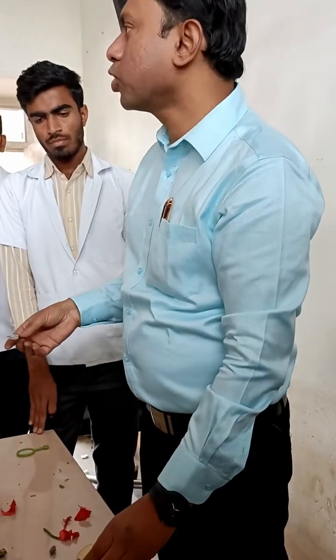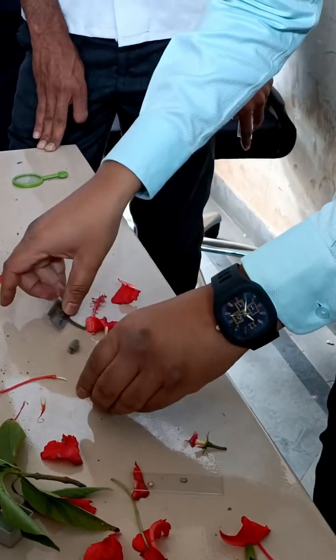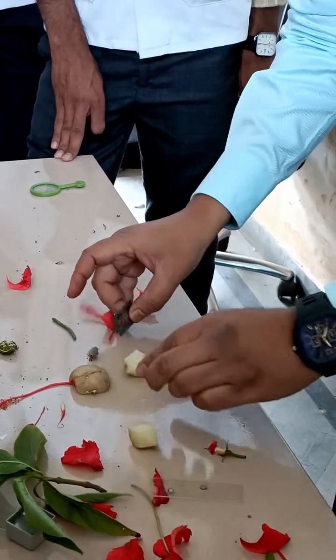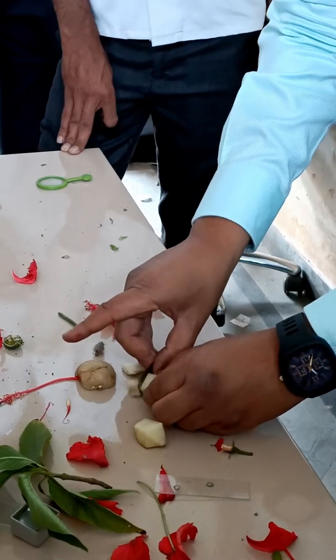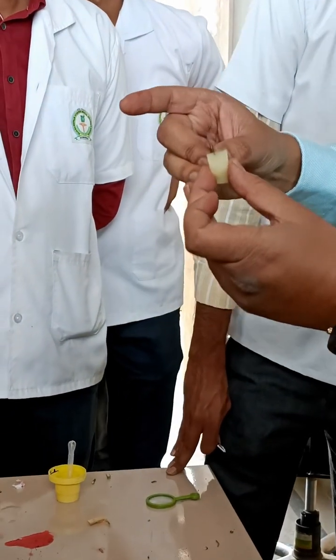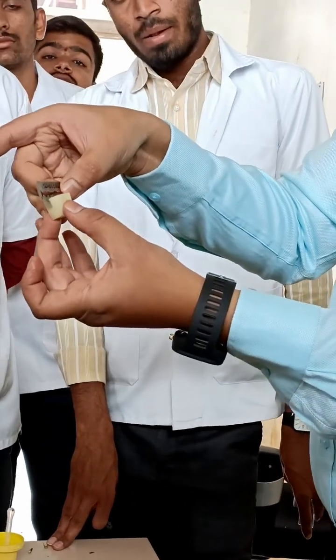Take the potato cube — a square-shaped potato cube like this. In this cube, you have to make a cut in the half, up to the middle, like this. We have to cut halfway through the middle of the potato.